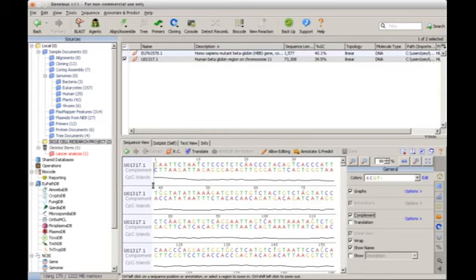Now for you to understand that in double strand DNA we're talking about the complements of each nucleotide base on the first strand. You understand now? As you can see, we have G here, then we have C, which is the double strand of this nucleotide sequence. Now we have A here, and then we have T, we have A, we have T. So this should tell you that G pairs with C, while A pairs with what?